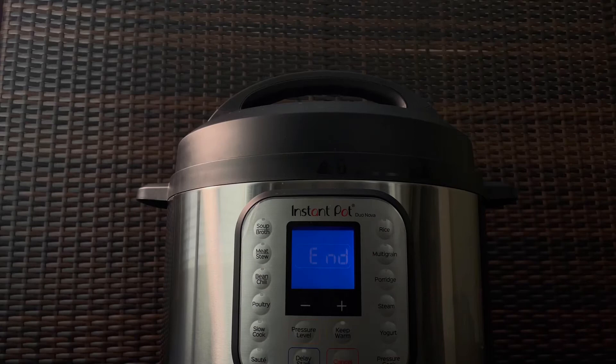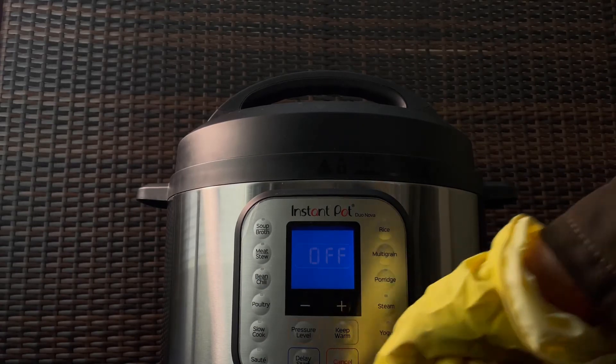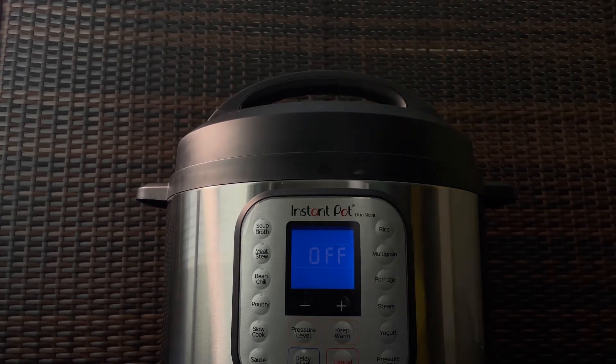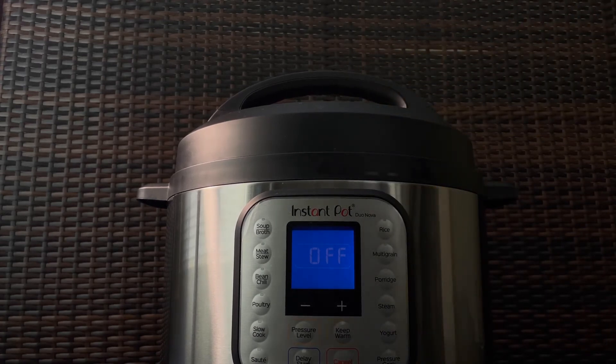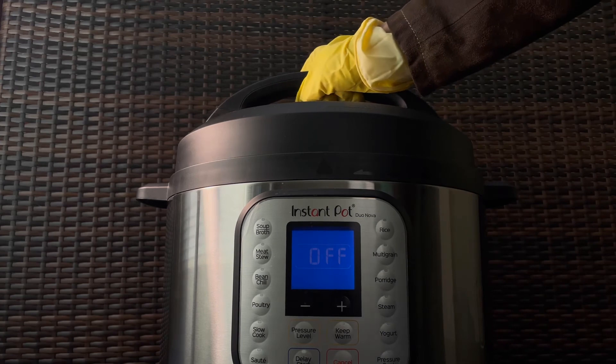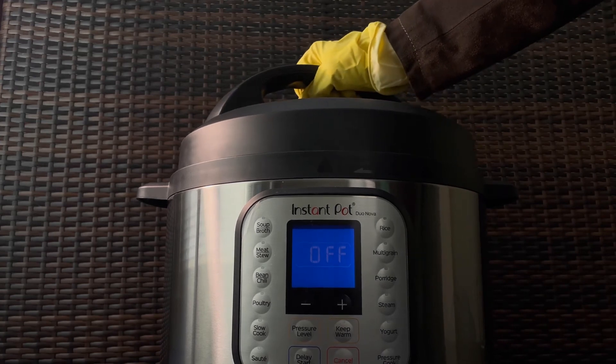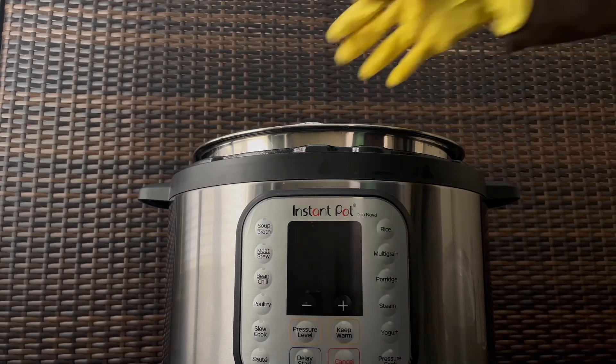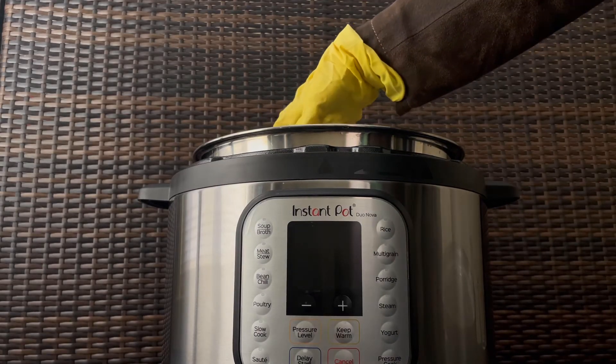After the time is up, simply hit that cancel button and quick release the pressure. Personally, I like to wear gloves to protect my hands from potentially getting burned by the hot steam. Once the pressure is released, open the lid and carefully remove each of the bottles and allow to cool.